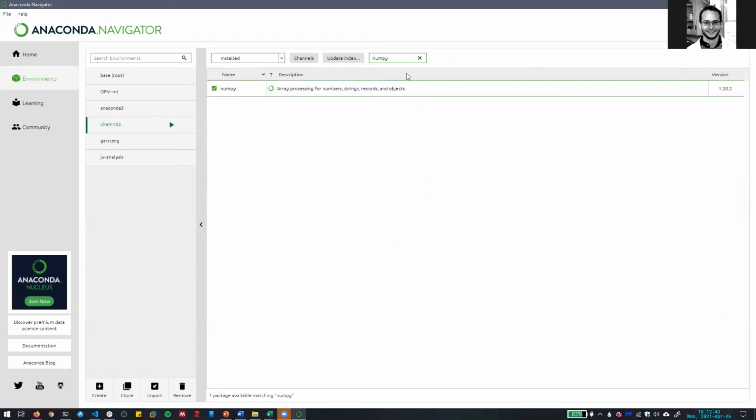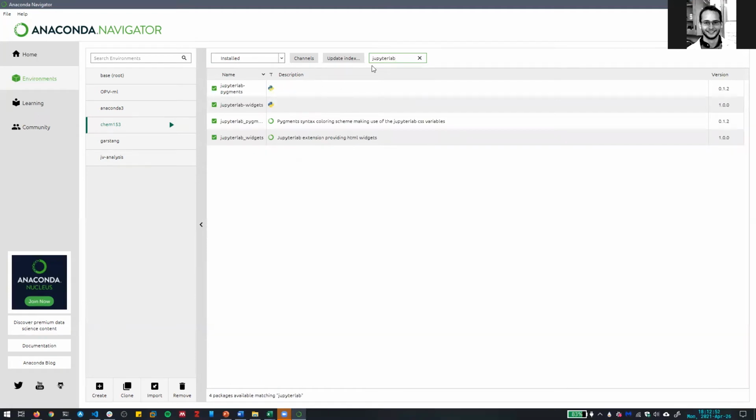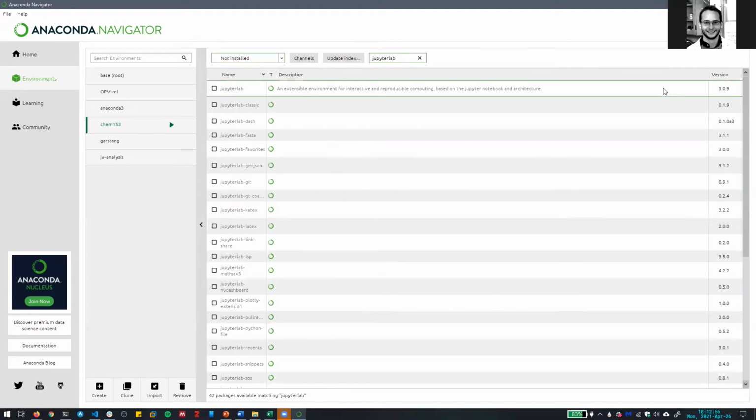And we'll be working with Jupyter notebooks to do most of the processing. I personally prefer Jupyter Lab, which actually, I don't have it installed in this one. But this one here, it contains Jupyter notebooks inside of it as well. And it's basically just a slightly more easy to use environment than just pure Jupyter notebooks. So I'd recommend installing Jupyter Lab, but Jupyter Notebook is also fine. Should have all the functionality as well.